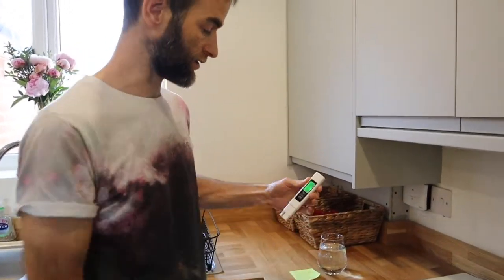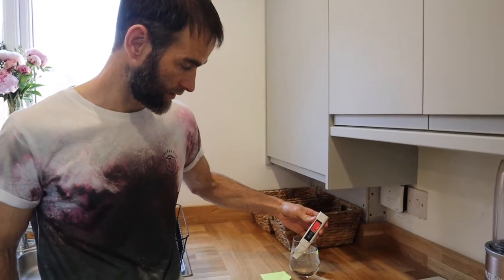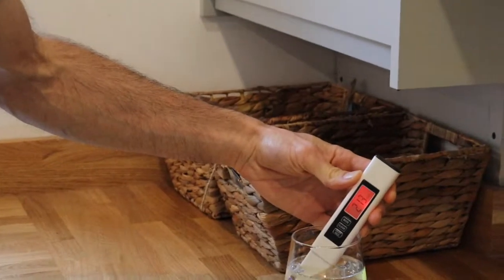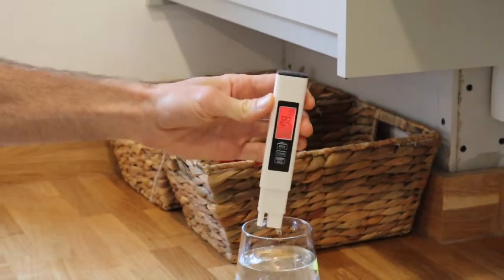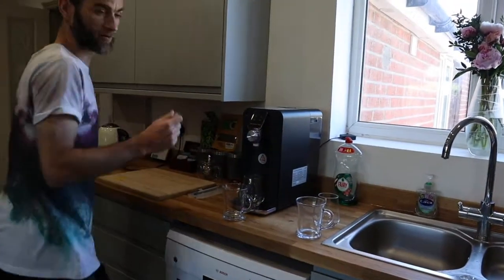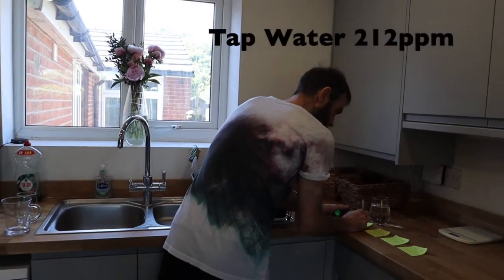So this is our tap water with nothing done to it, and you can see that's 212 parts per million — 215 on a second reading. That's just our regular tap water. So, 212 parts per million.